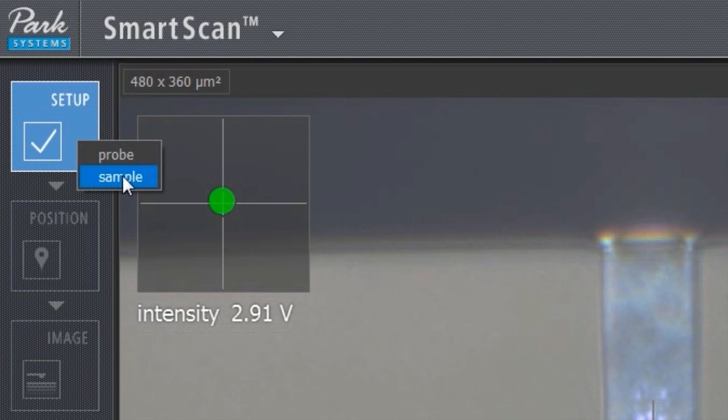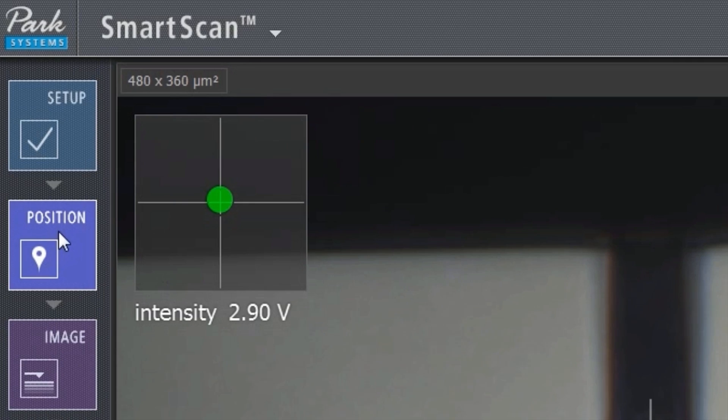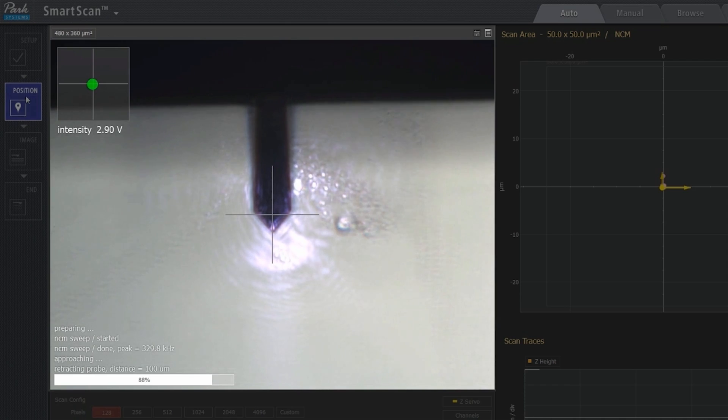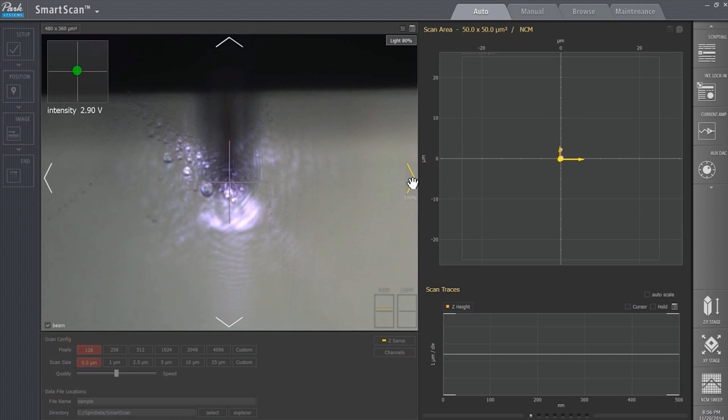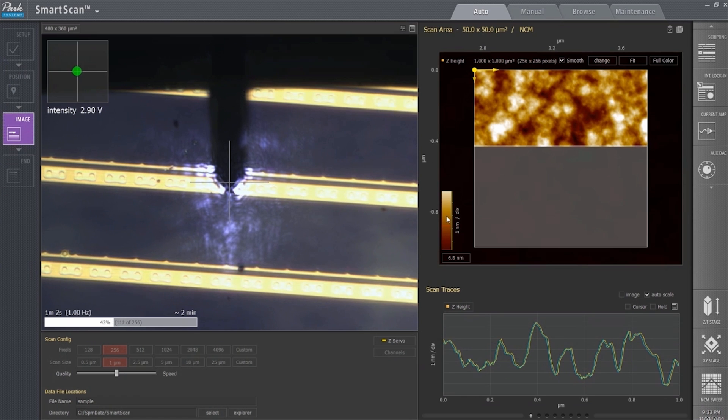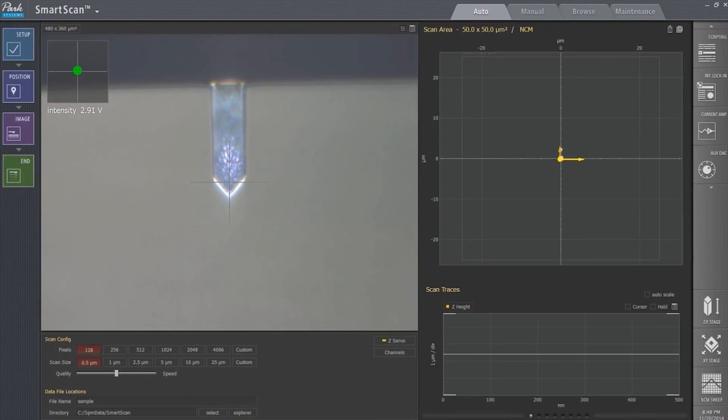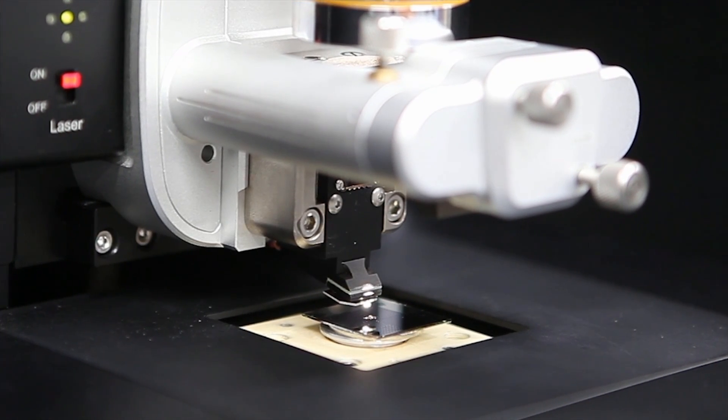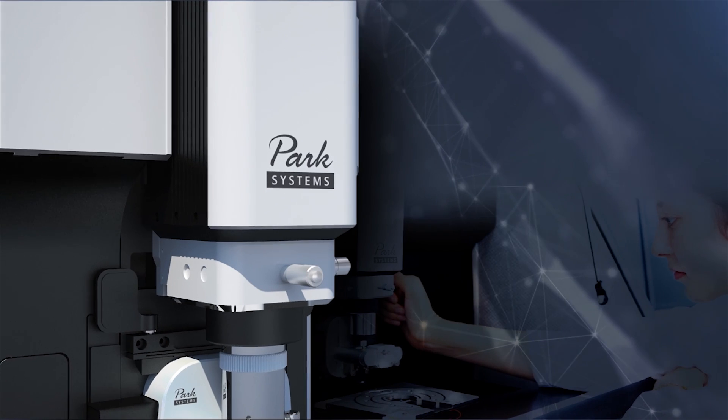Park Systems builds upon this superb hardware technology with the dedicated operation software Park Smart Scan, making it possible for anyone to obtain optimal AFM images by using the software's auto mode without the need for an experienced operator. A few simple clicks and Park Smart Scan automatically calculates optimum values, making AFM image measurements simple and easy.